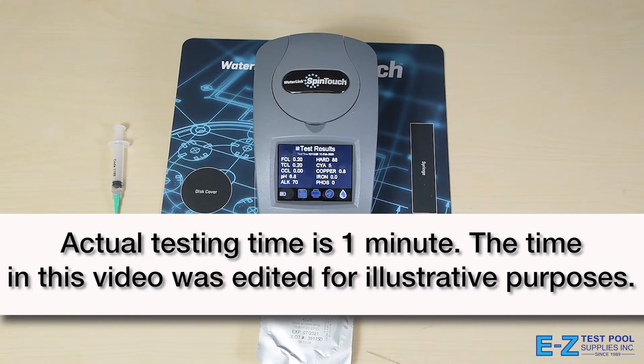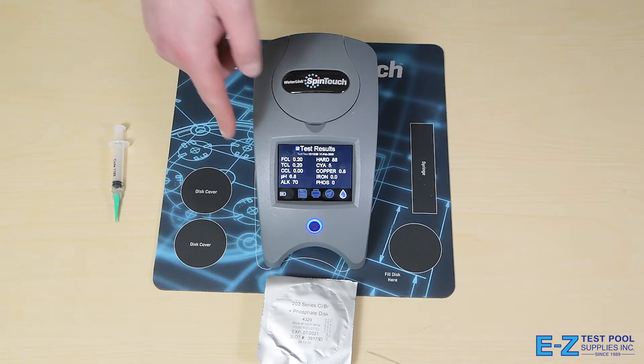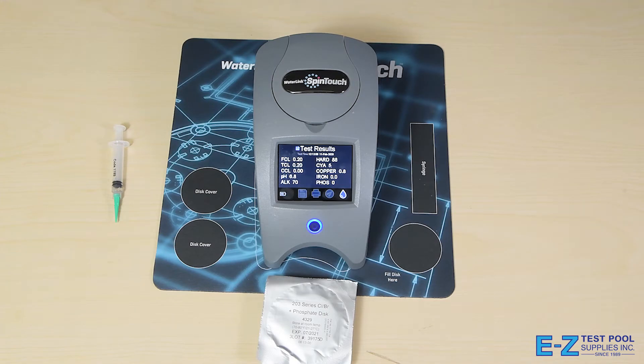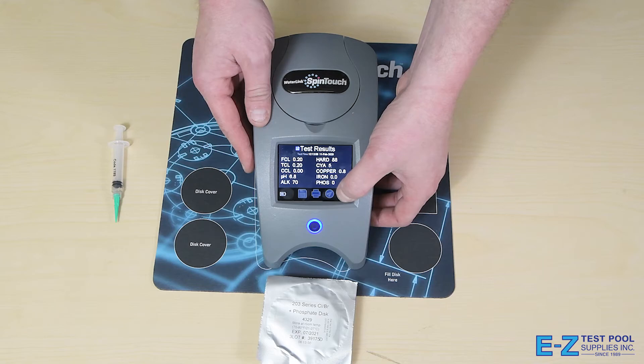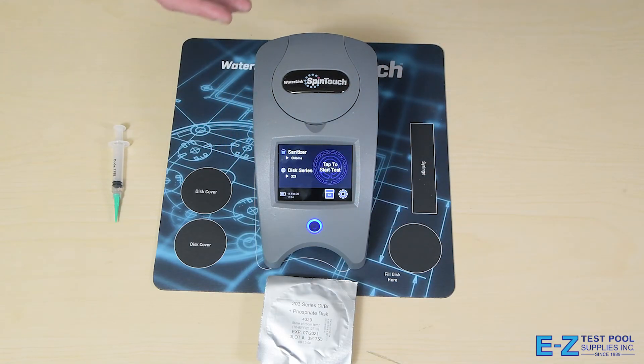Just like that, our test is finished. As you can see, the screen will provide all of the results on all the levels I just mentioned. This is great and with the provided app or the computer software, you're able to send them to it and have detailed descriptions on how to remedy. With that software, you're able to put in customer and your business information as well as your own chemical line to recommend the proper dosages.